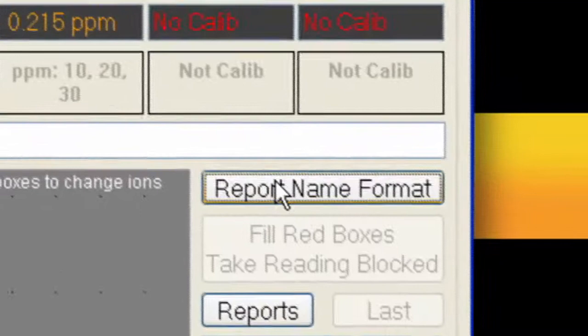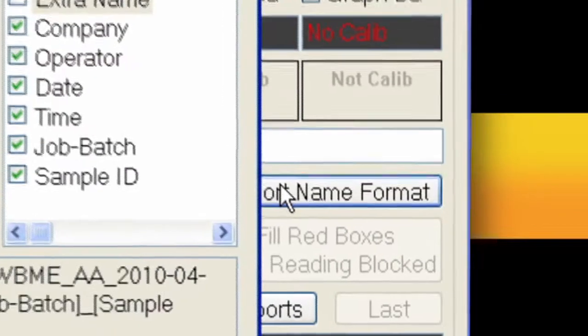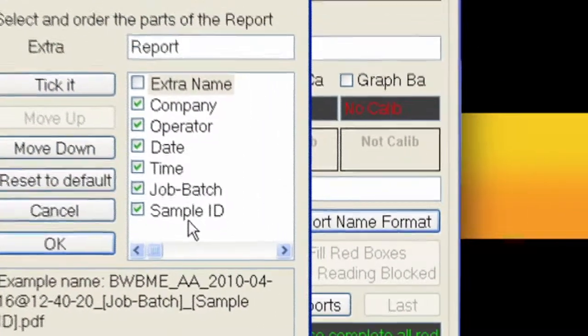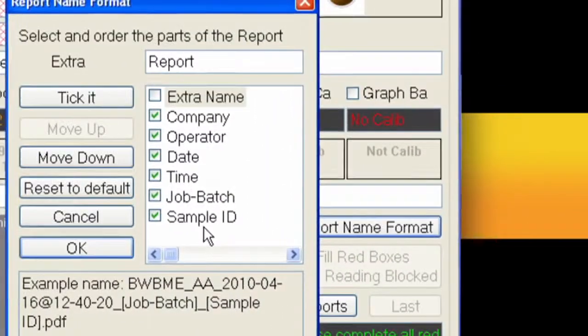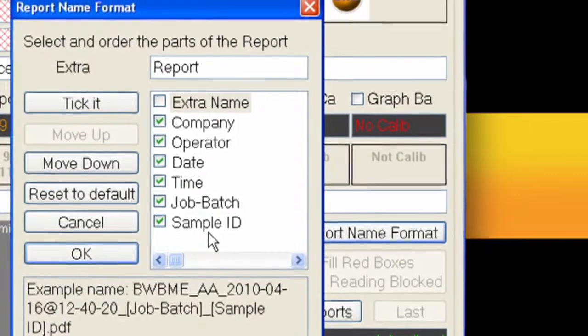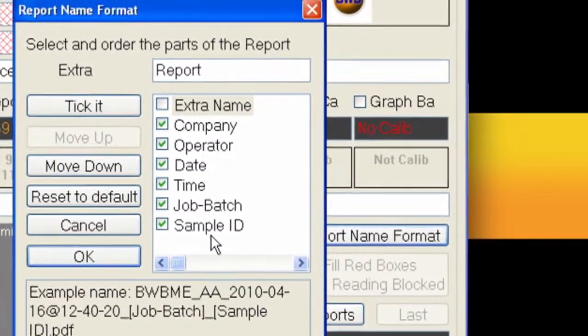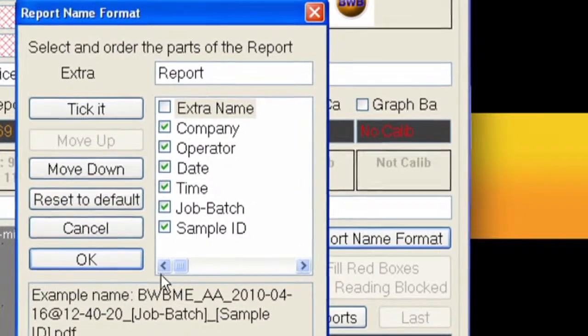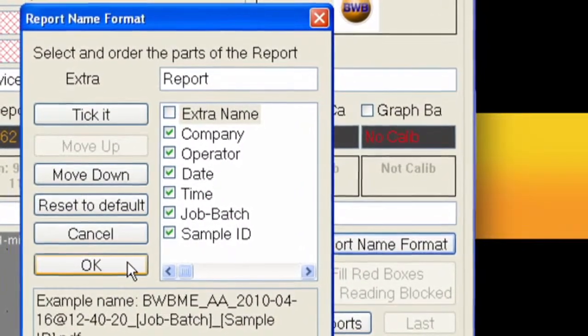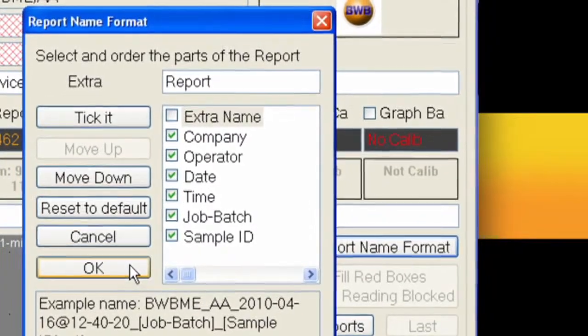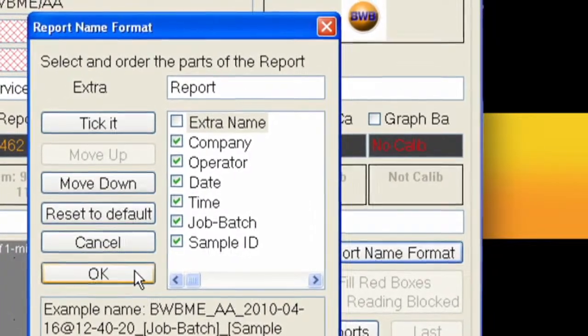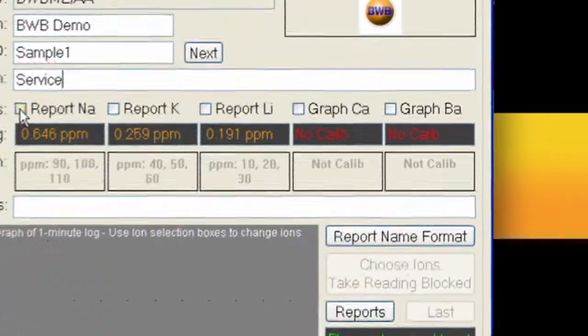Click on the format button to open these preferences. You have a variety of settings available to you during setup which allow you to further customize your XP experience, including report names and report layouts. Close the box.